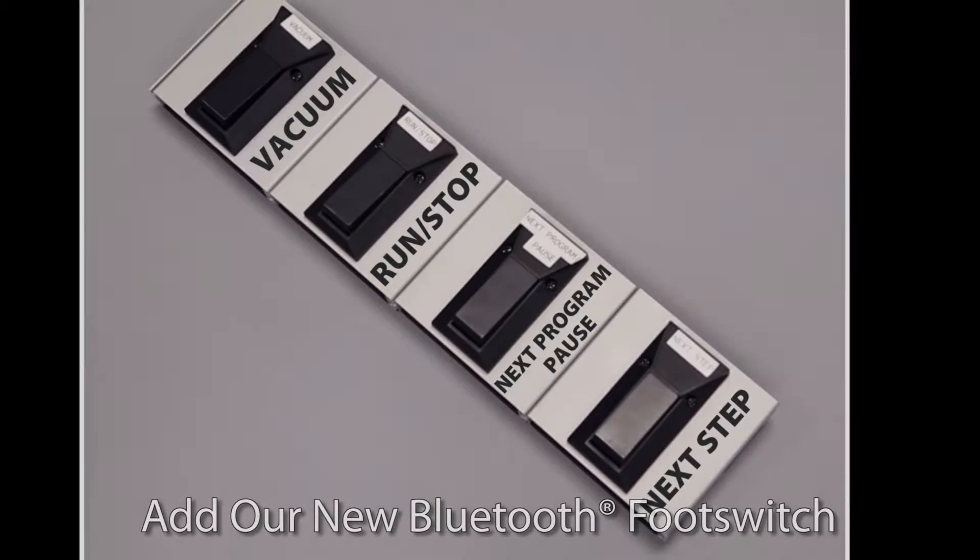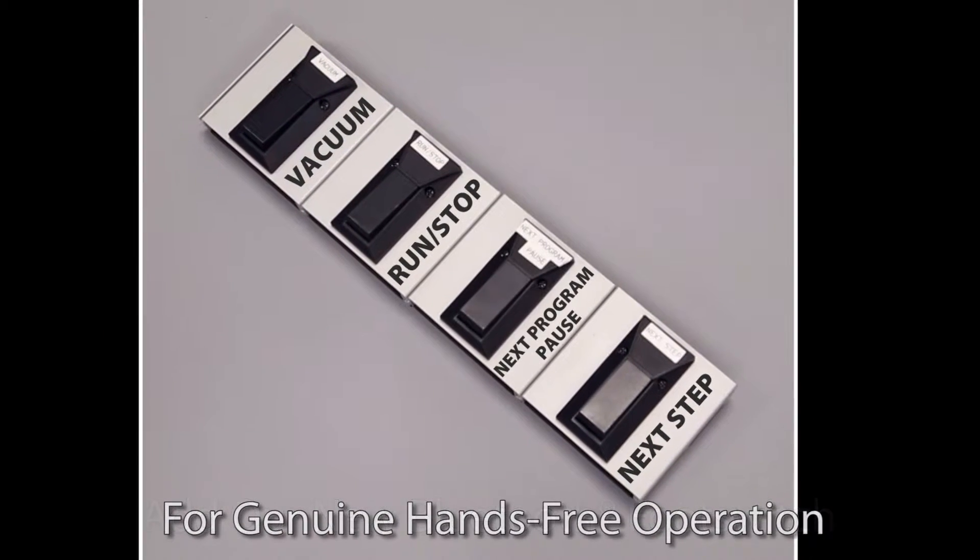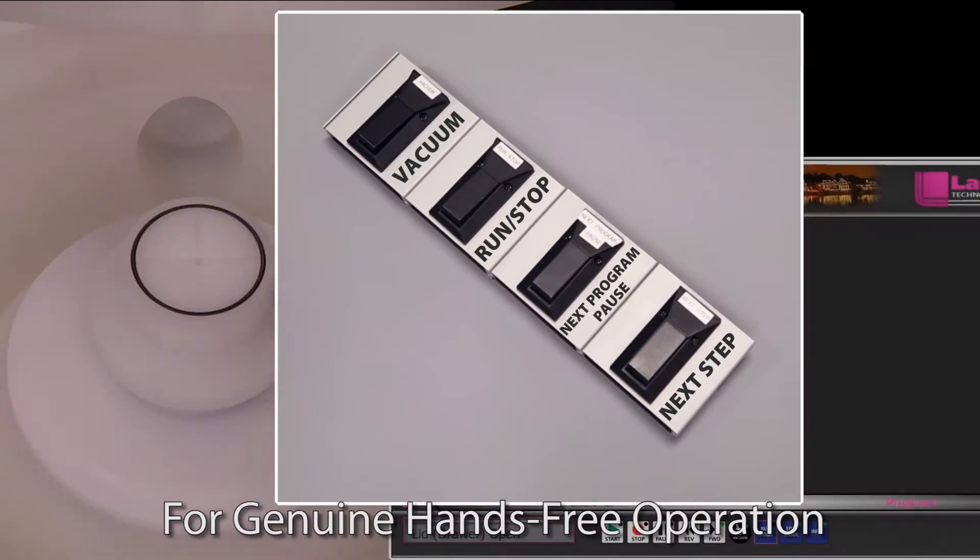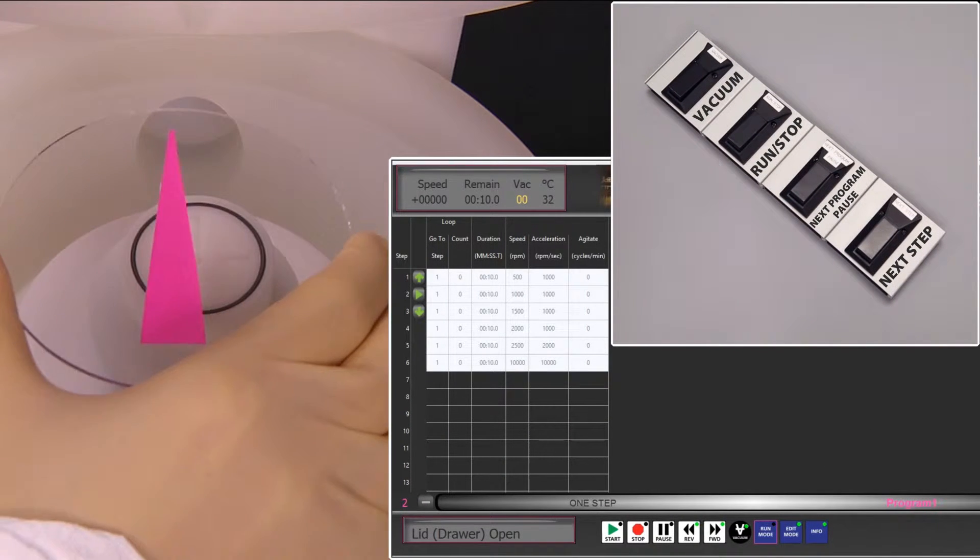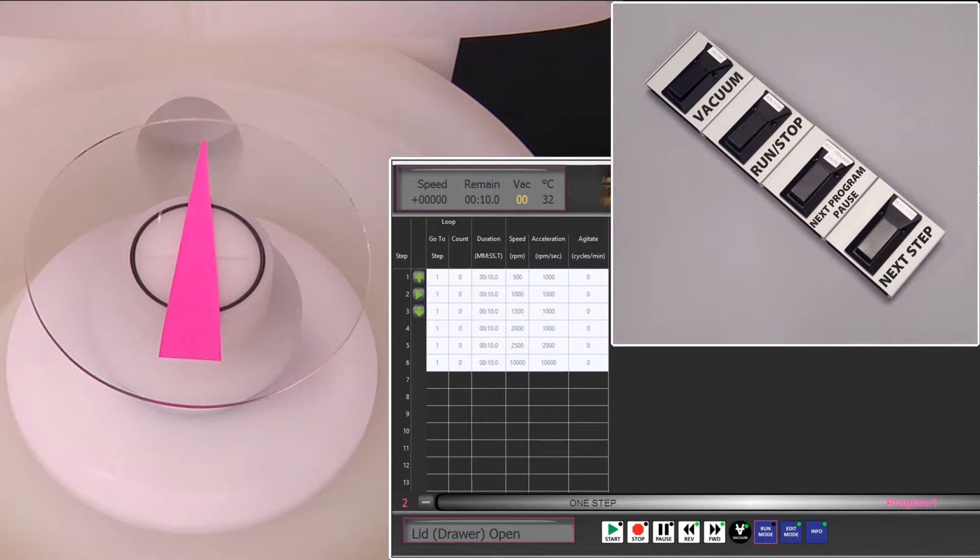Add our new Bluetooth footswitch for genuine hands-free operation. The Laurel footswitch is truly multifunctional and is not limited to a simple run-stop capability.